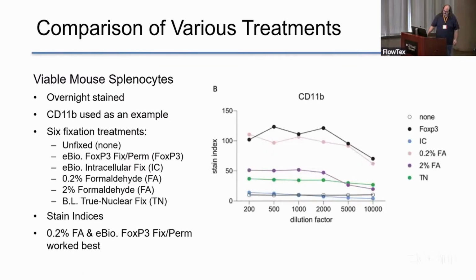But they also did it using not just the eBio's FOXP3 fix and perm set.